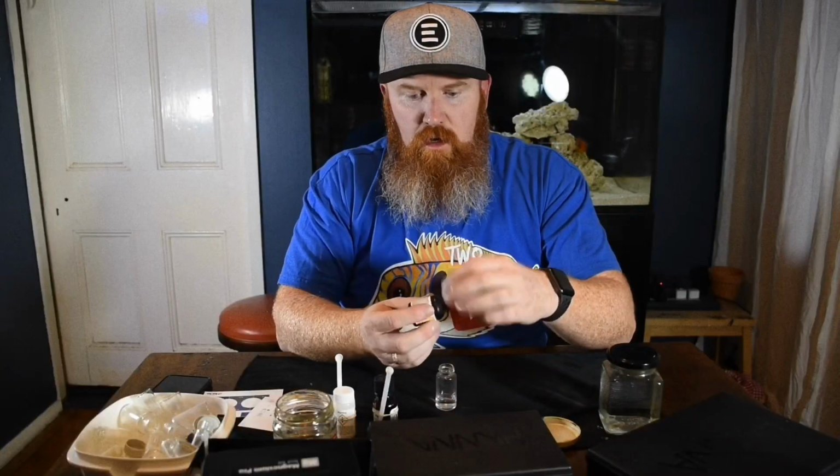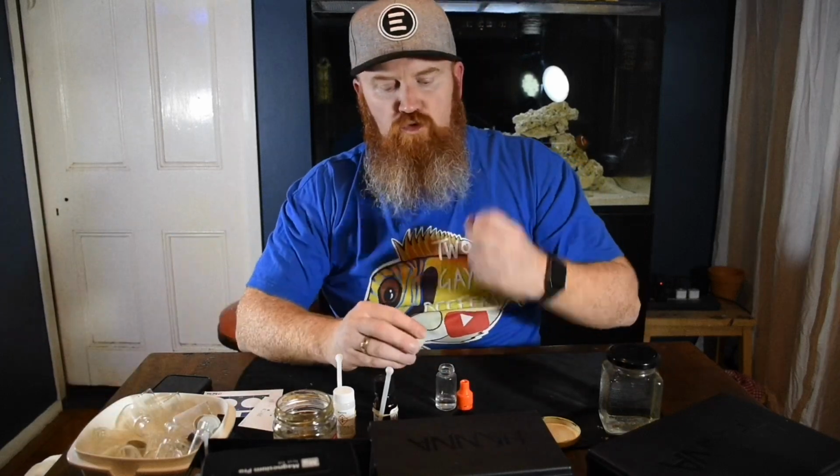1, 2, 3, 4, 5. Note you keep the bottle directly up and down when you're dropping it out. That gets the full drop out of it each time. Give it a shake for 10 seconds.